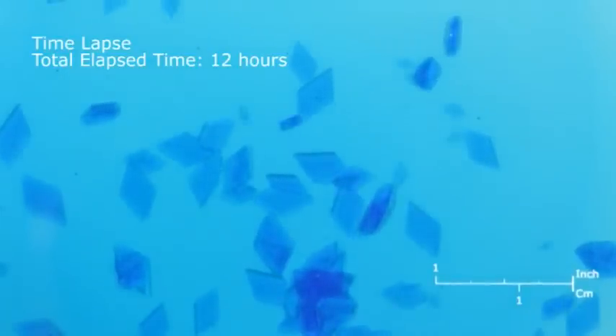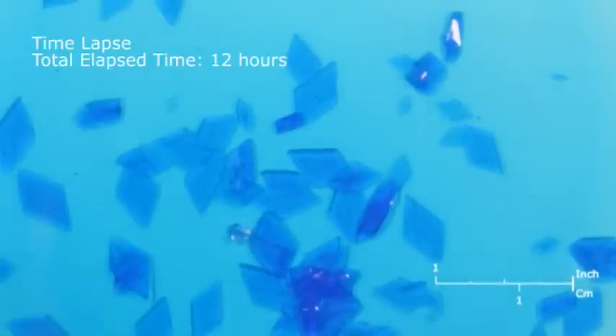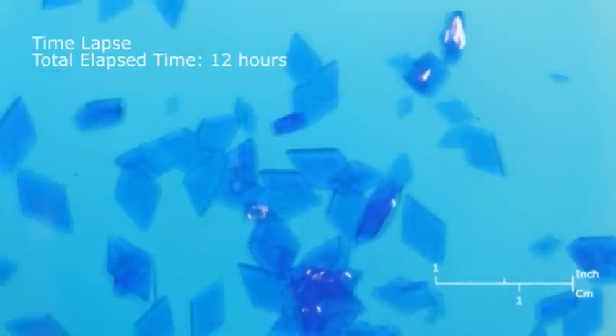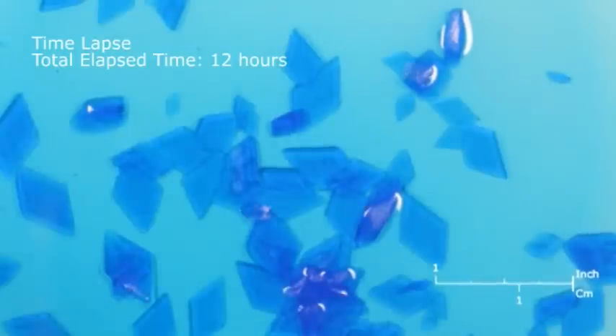Copper sulfate in water forms triclinic crystals of copper sulfate pentahydrate. You can grow several small crystals, or remove all but one or two of the crystals if you want better growth. When you are satisfied with your crystals you may remove them from the solution and examine them.